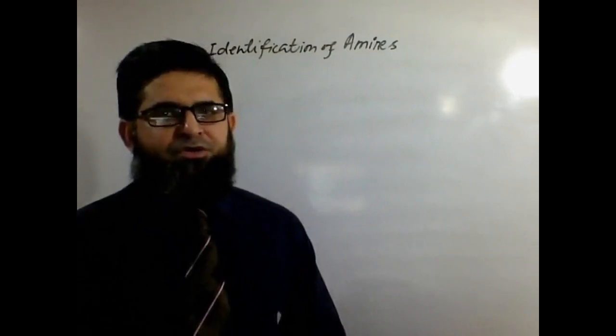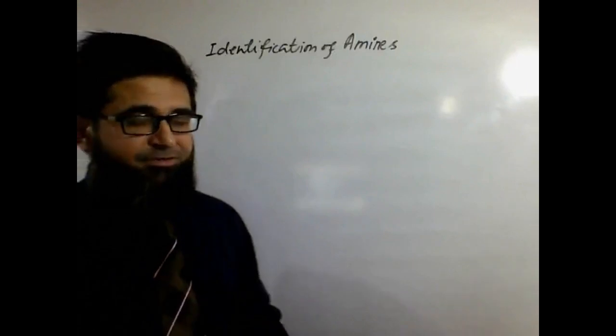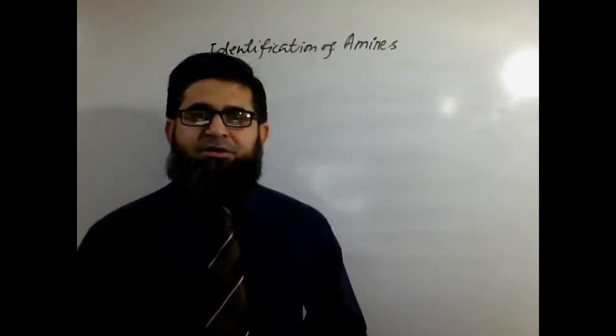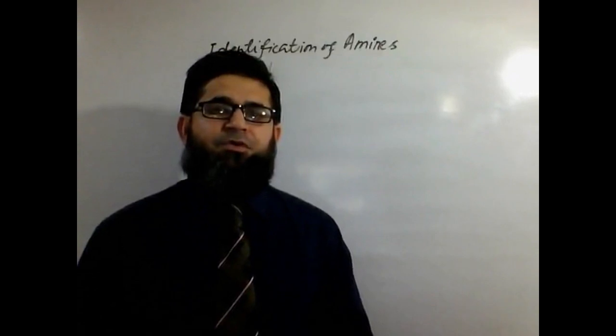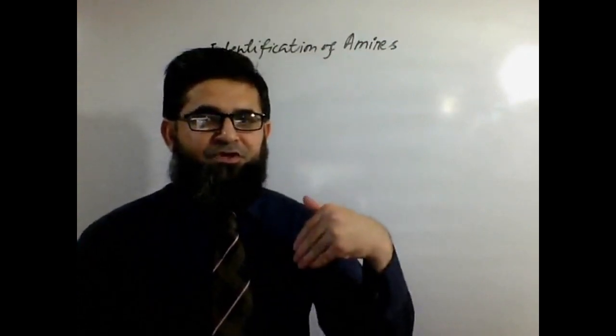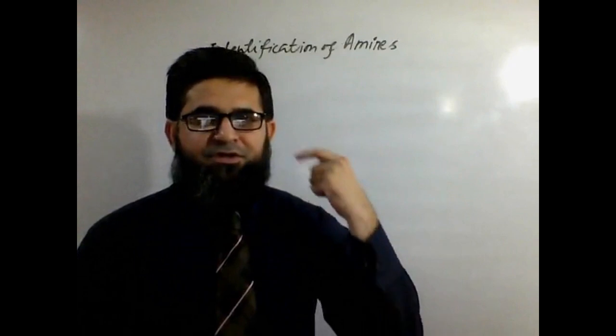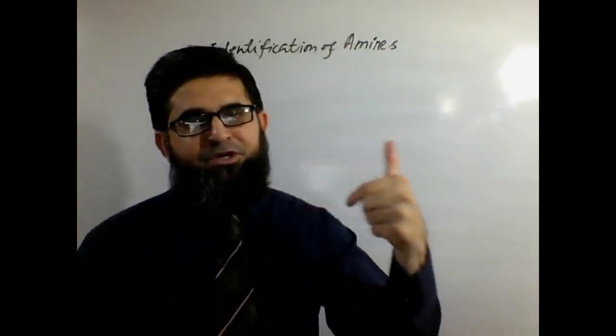Today I am going to start a lecture on identification of amines. In one of the previous lectures, I started off with the litmus solution test. I discussed that if we give you an unknown compound in a lab and ask you to identify the nature and the chemistry of the given compound, you need to start with the litmus solution test.